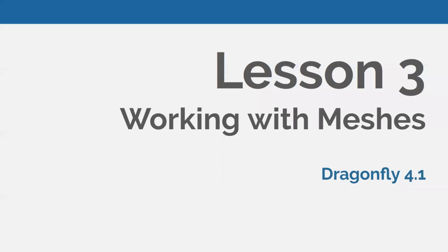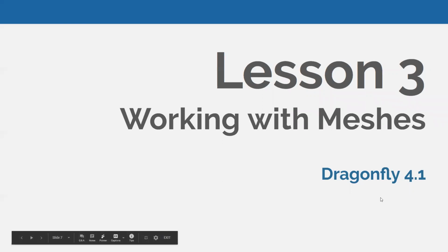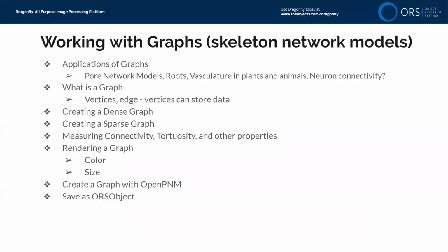So dive into lesson 3. It says working with meshes. Oops, that should be working with graphs, skeleton models. We are using Dragonfly 4.1, the out-of-the-box experience. So if you download and install Dragonfly 4.1, you will be able to follow along and do all of these activities.